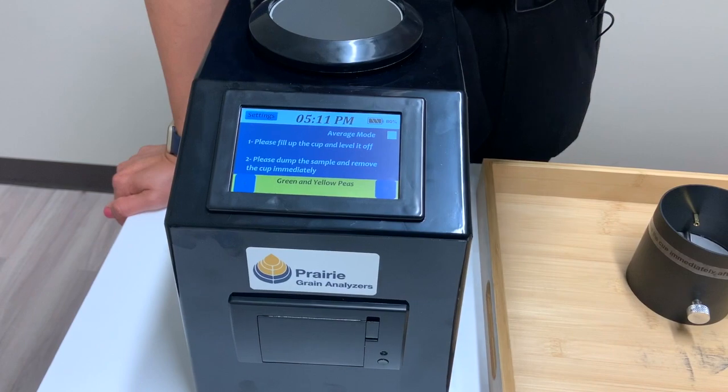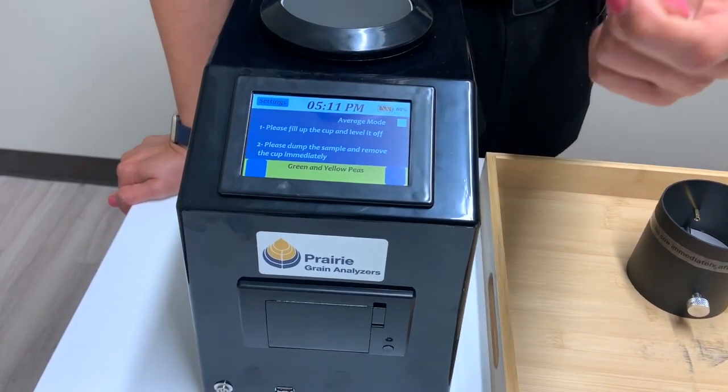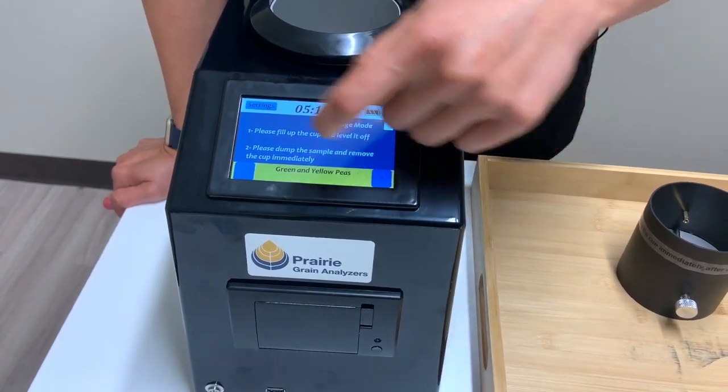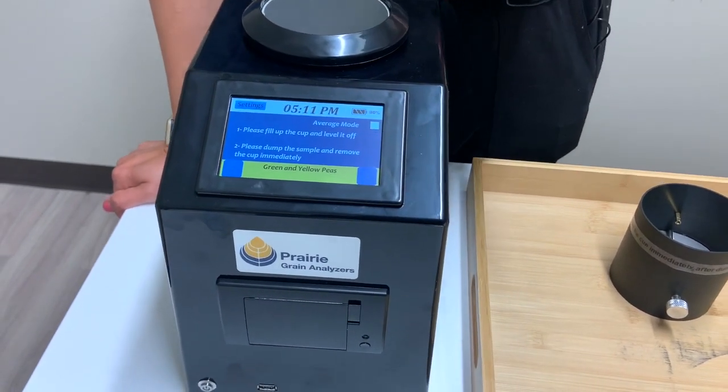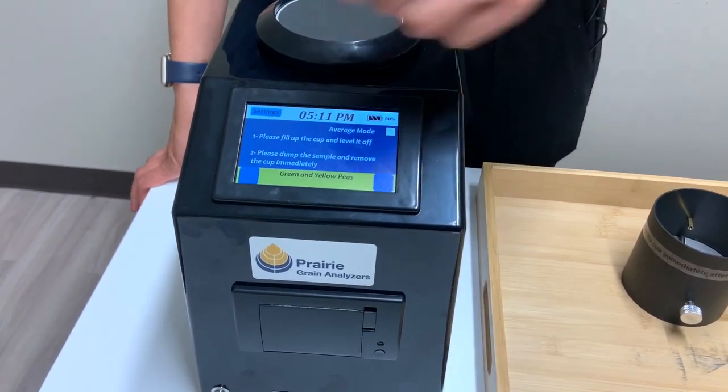You want to avoid using your fingernails because it just doesn't read as well. You can see it's not really responding to my fingernail. You also want to avoid using any sharp objects on the touchscreen.